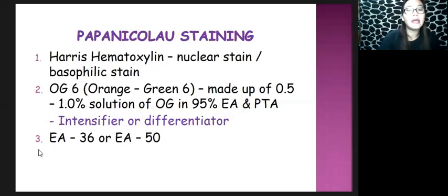EA here stands for Eosin Azure. The EA in 95% stands for ethyl alcohol, but for the third stain, EA stands for Eosin Azure.